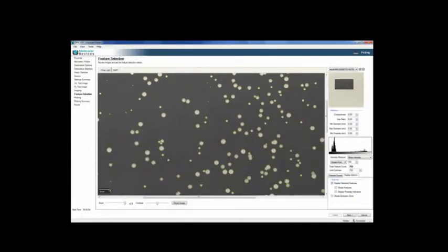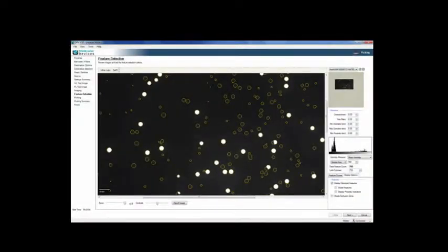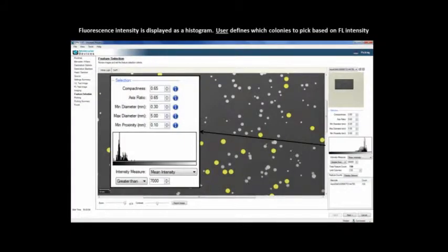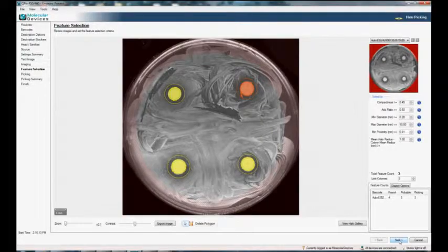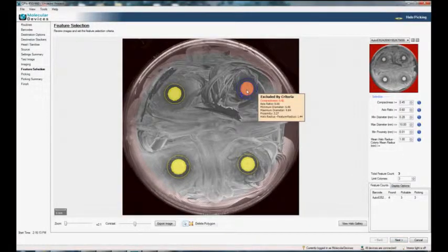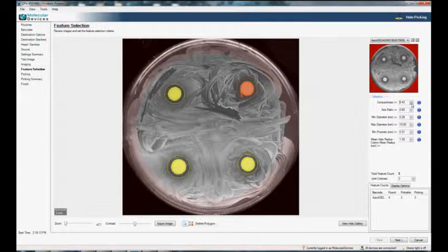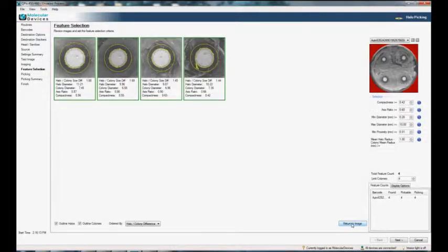Alternatively, we support smart picking, which enables scientists to focus on only the high-value colonies. For example, QPIX supports fluorescence detection, colorimetric detection, and halo recognition software to identify and isolate only those colonies which have a desired phenotype or biological function. Smart picking can drastically reduce downstream processing and therefore save huge amounts of time and money.